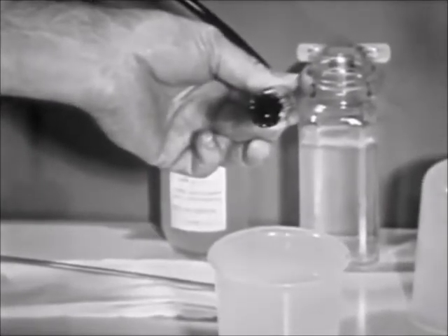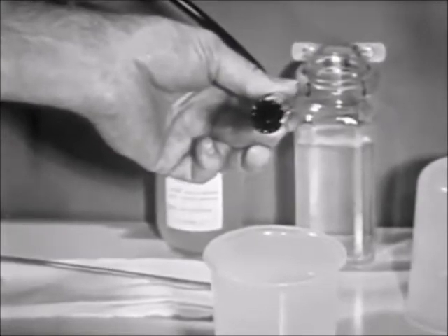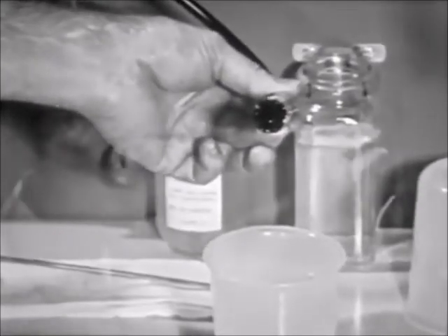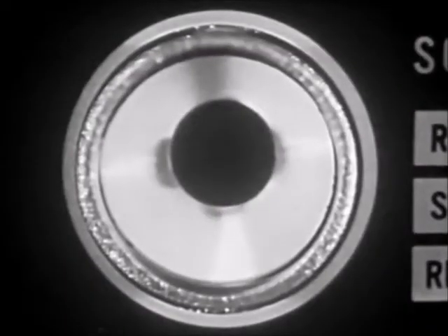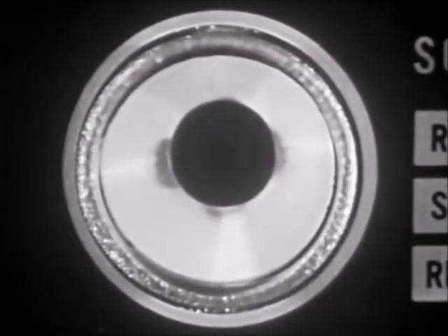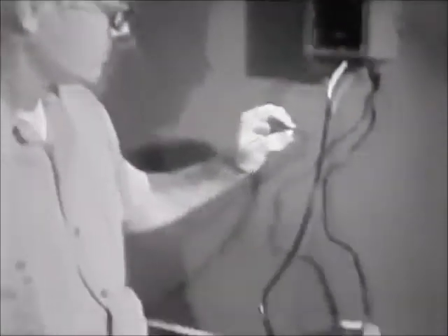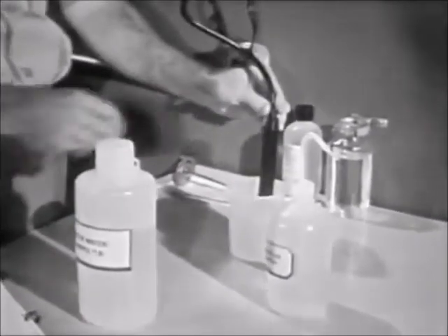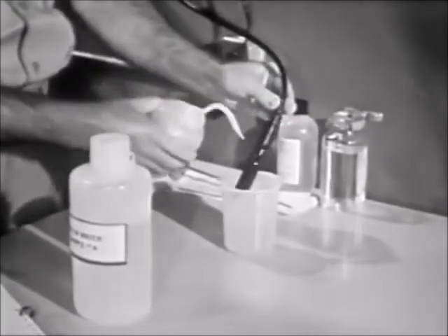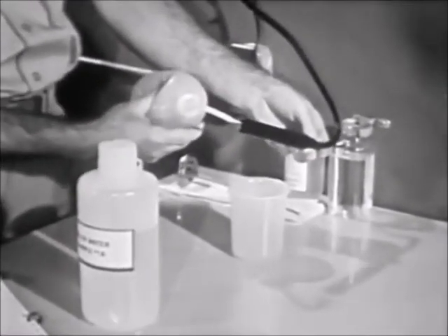If the cell is not rinsed before drying, an insoluble coating may form on the electrodes. When testing, this may prevent you from sharpening the tuning eye and it may appear fuzzy. If this occurs, do not attempt to clean the electrodes by hand — this could cause permanent damage. Instead, rinse the cell again with distilled water and test again.